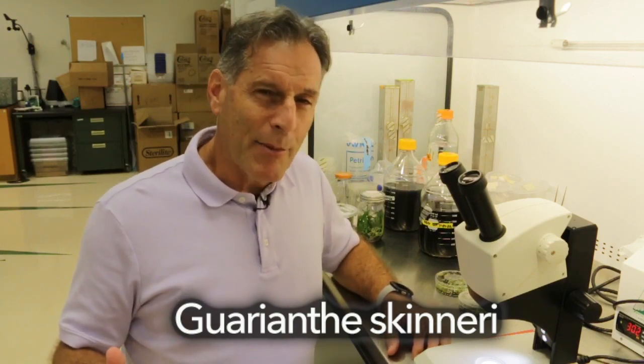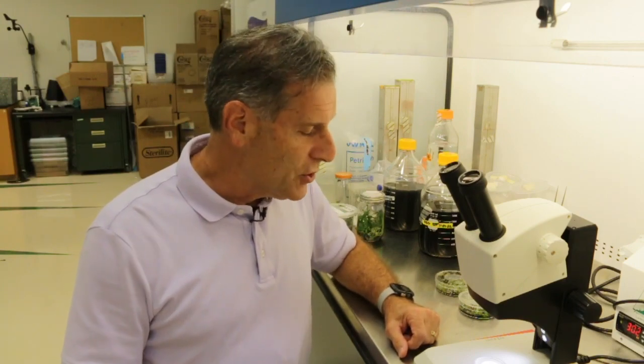Usually when I come in the laboratory, I spend a little bit of time first thing looking at all the plants, everything, and try to kind of get an overview. I write down things that need to be done, and it's a good idea so that I have a fresh idea of what I need to do on a certain day.